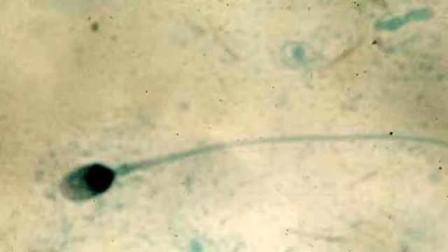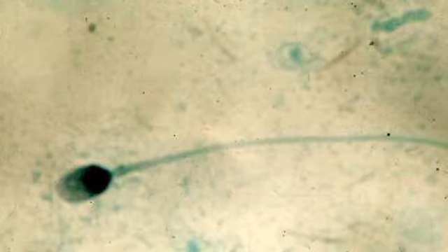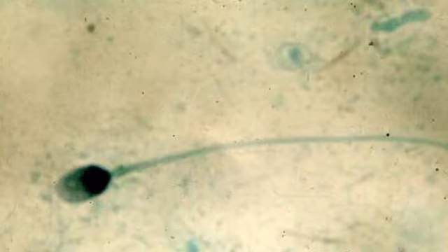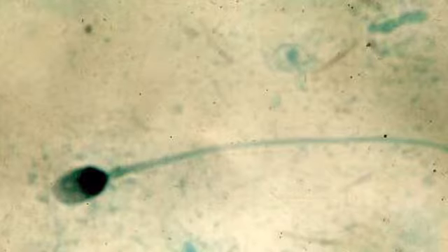So you should ask the doctor if he's familiar with what they look like, and if so, then tell him to go ahead and make a slide. And he should make a slide with what we call a smear. In other words, you take a swab and moisten the swab with the stain, and then swab that across the microscope slide. But don't let him throw the swab away, because we want to do additional testing on it.